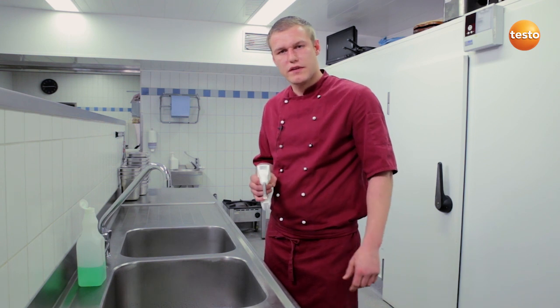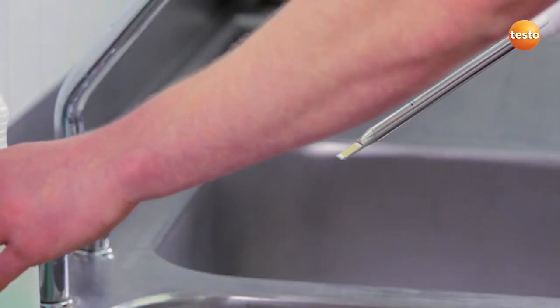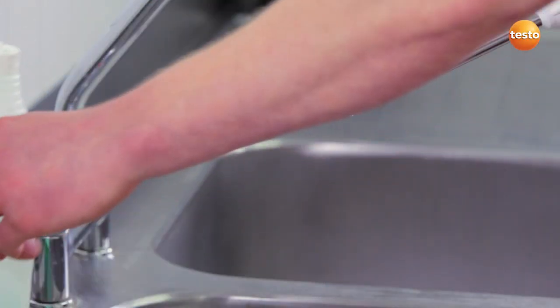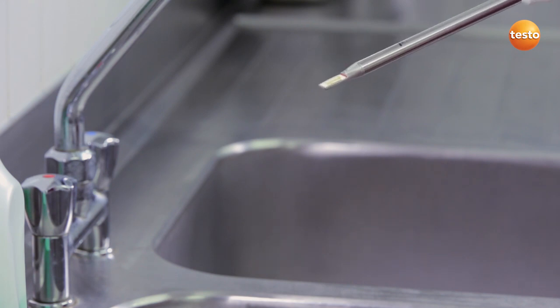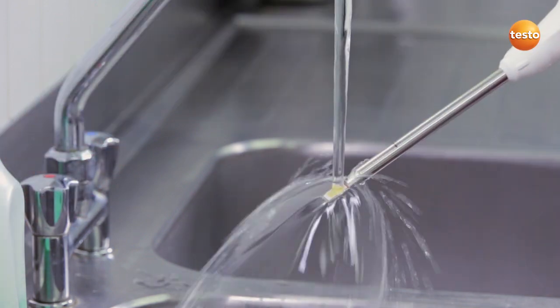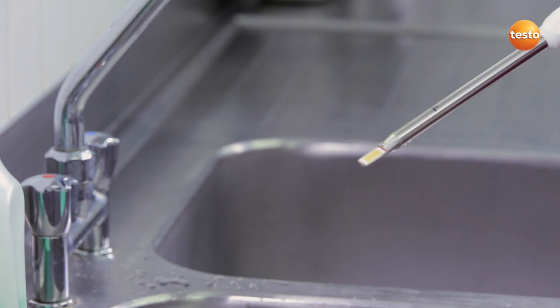Because the Testo 270 is splash-proof, it's no problem to hold it under running water. To clean it, it's enough to clean the sensor under running water with a mild detergent. It's important not to use any aggressive cleaning products or abrasive sponges. Then simply dry it off carefully with a soft paper towel.